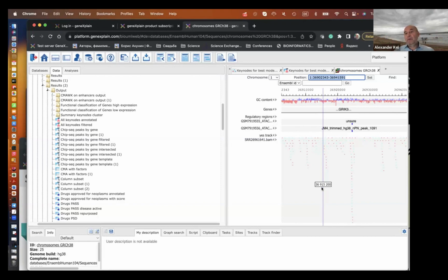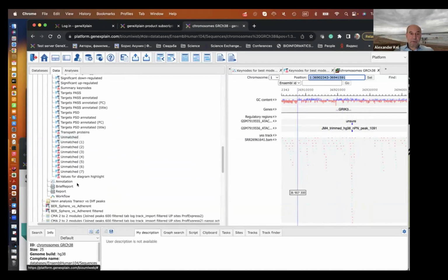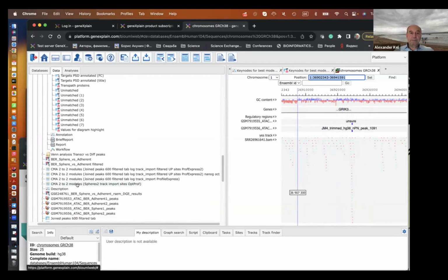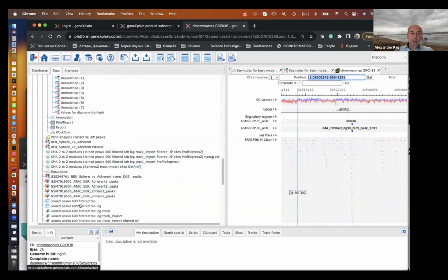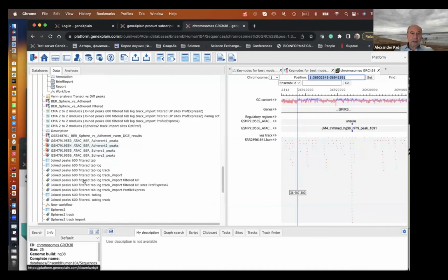And it would be important, for instance, to search for motifs which are more frequent in a high peak, but less frequent in the low peaks. And that's what we have recently developed, a tool which is exactly doing that. So you can put in the tool the information about the peak height, in a form like this.